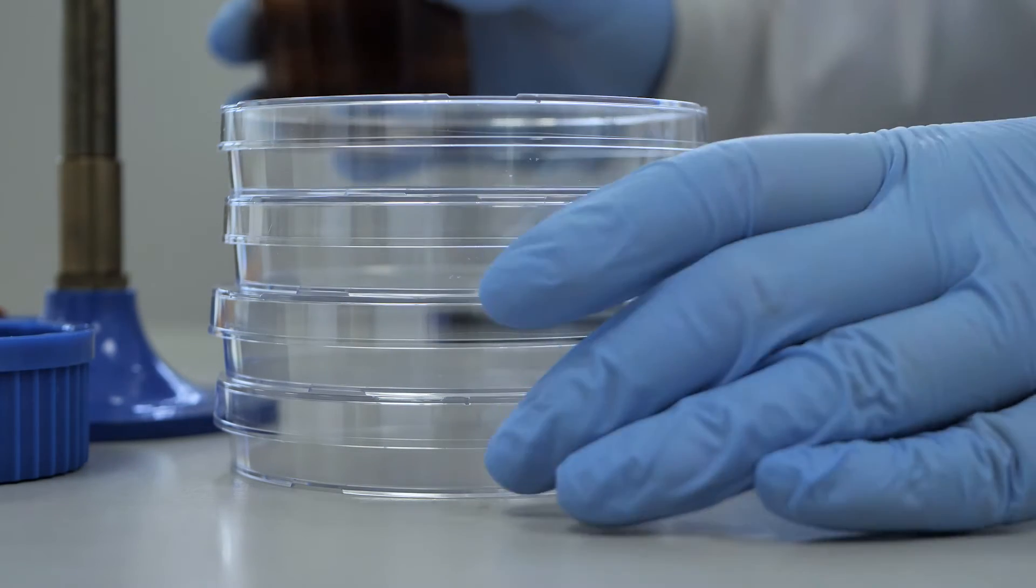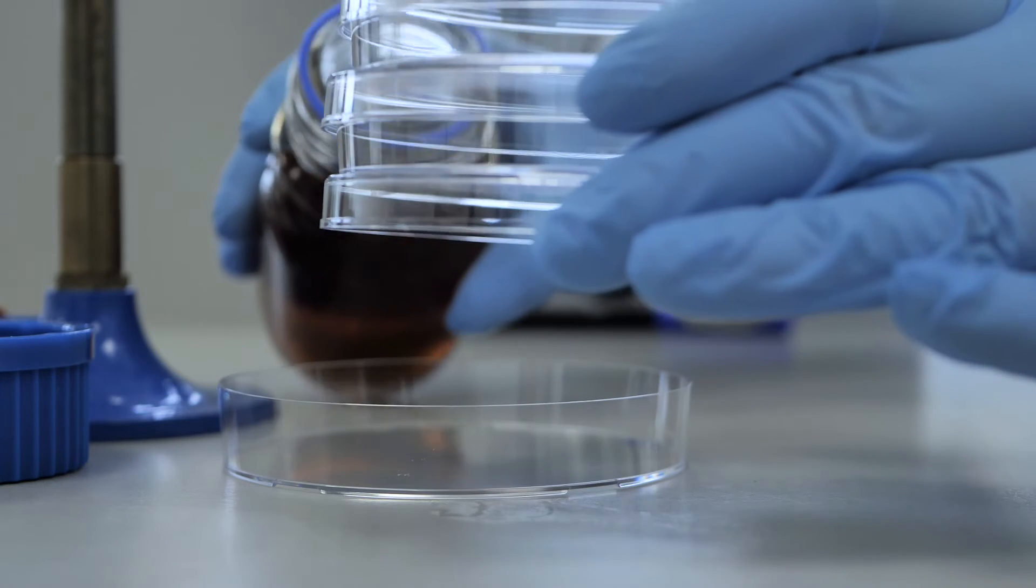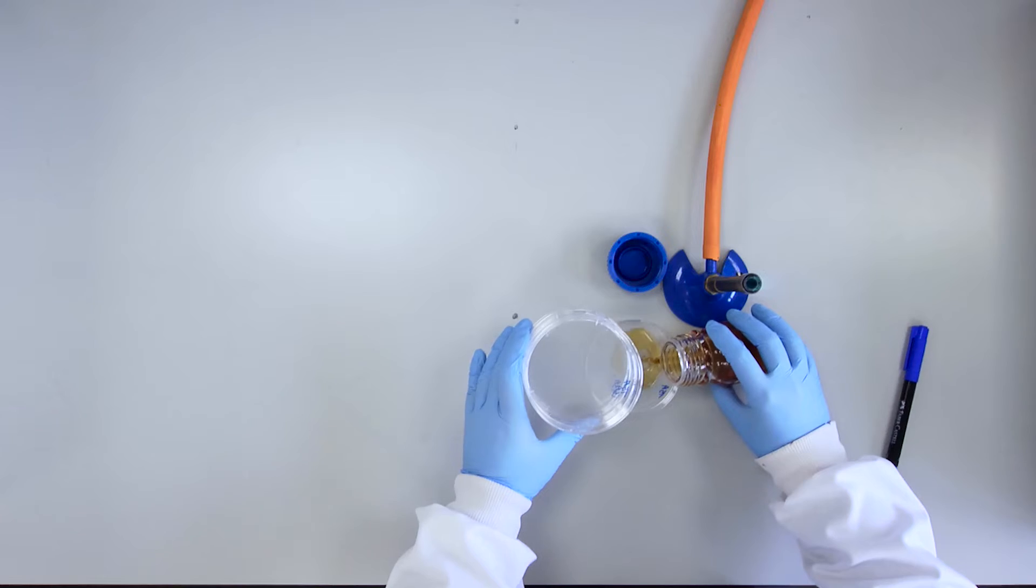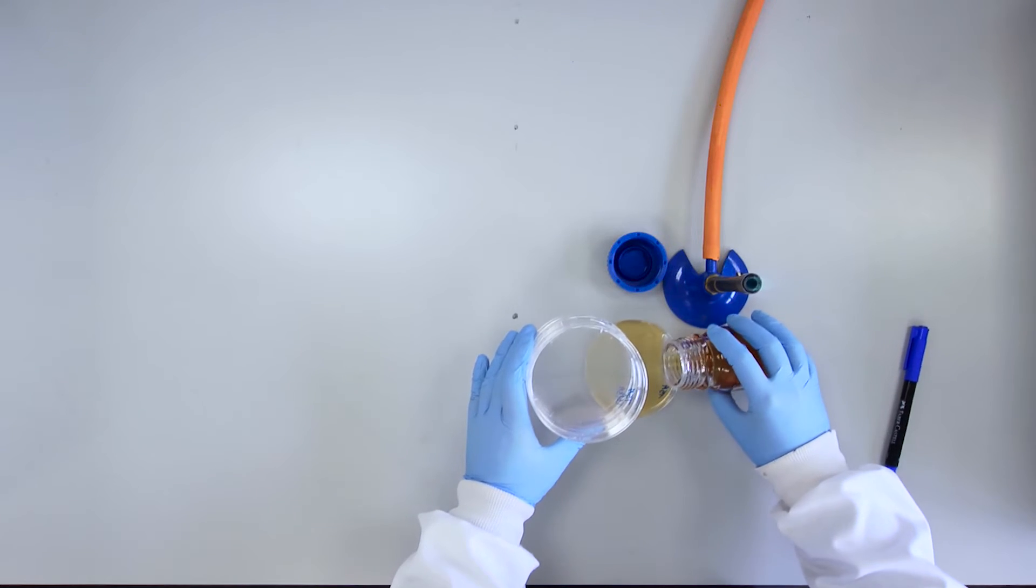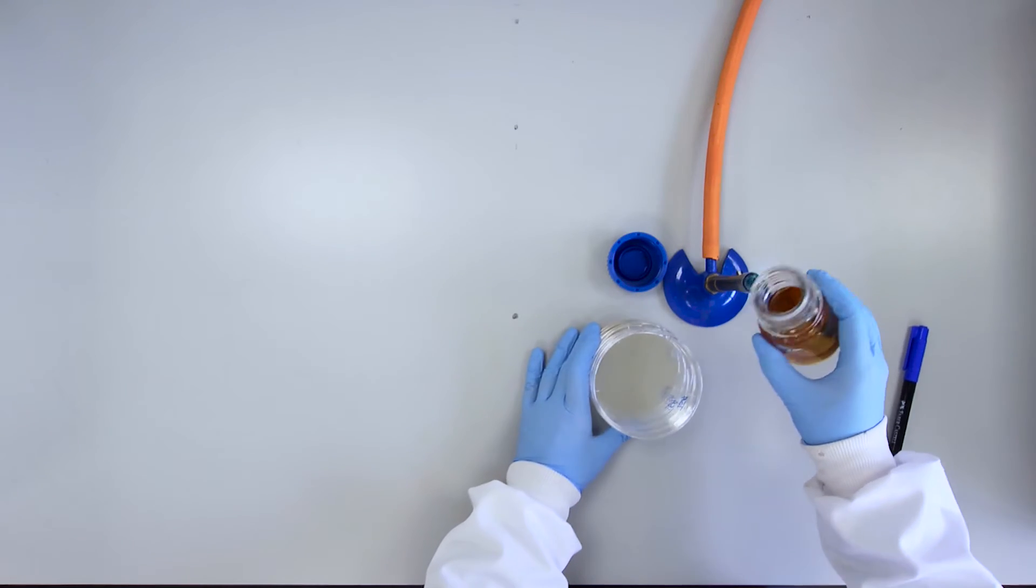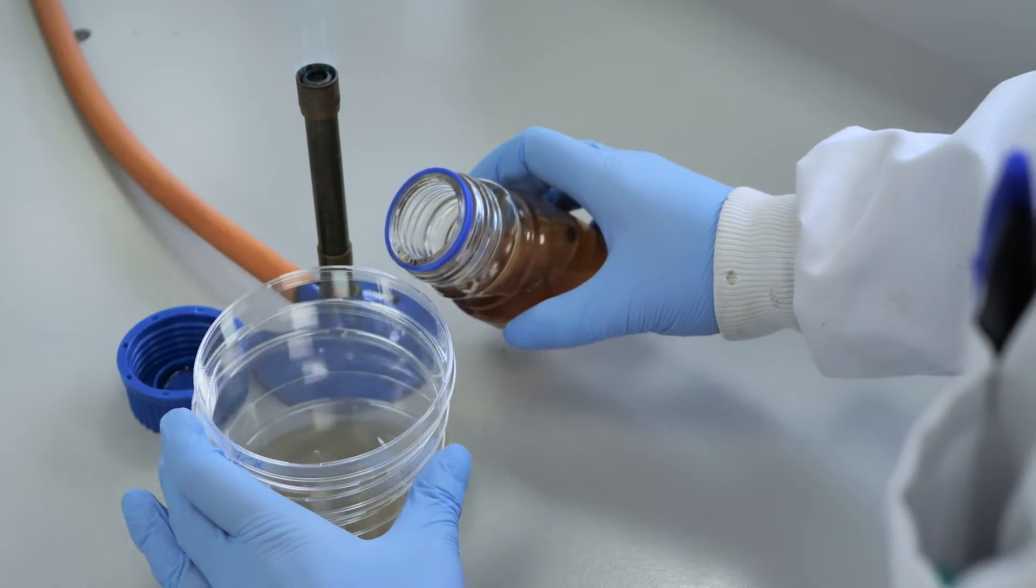Lifting the lid of the bottom plate, pour approximately 20 to 25 milliliters of molten agar into the plate. Replace the lid.